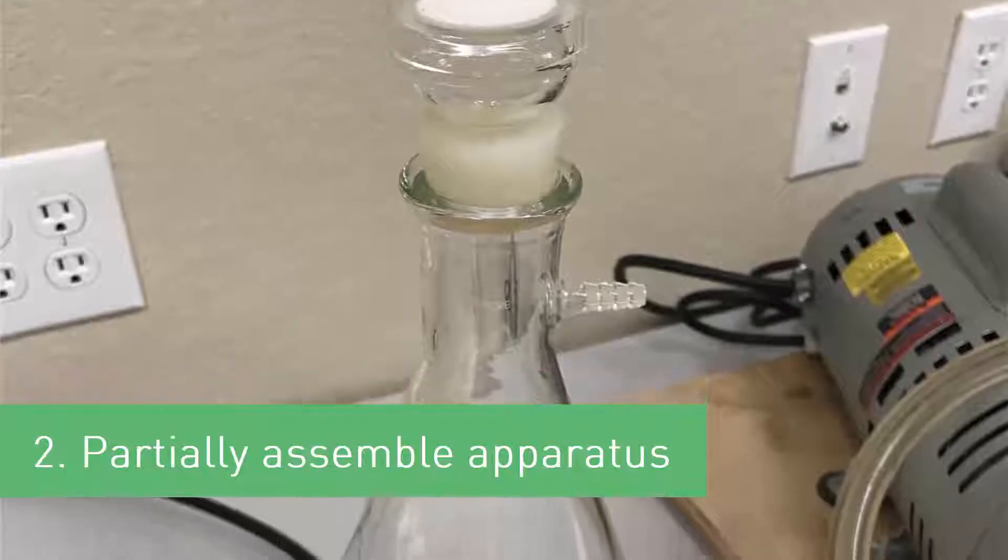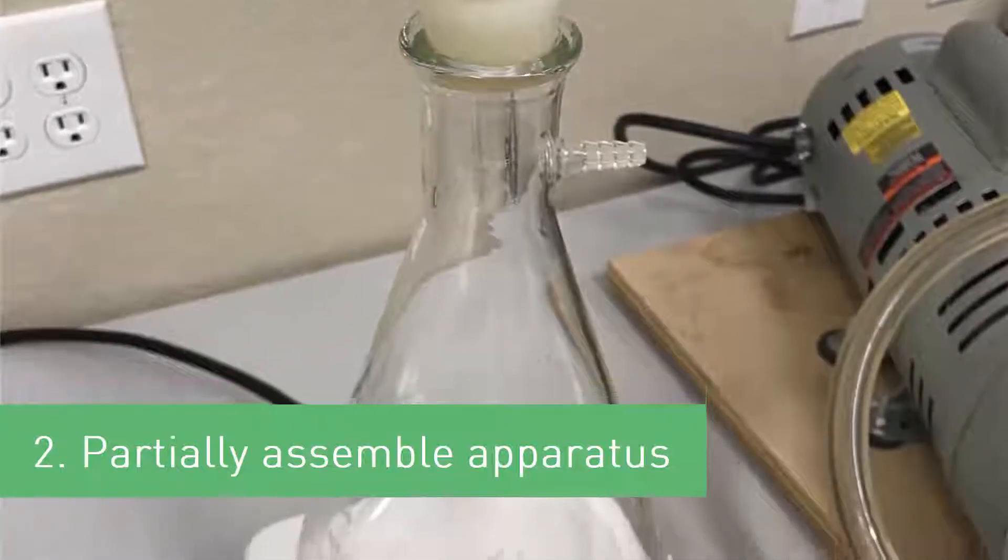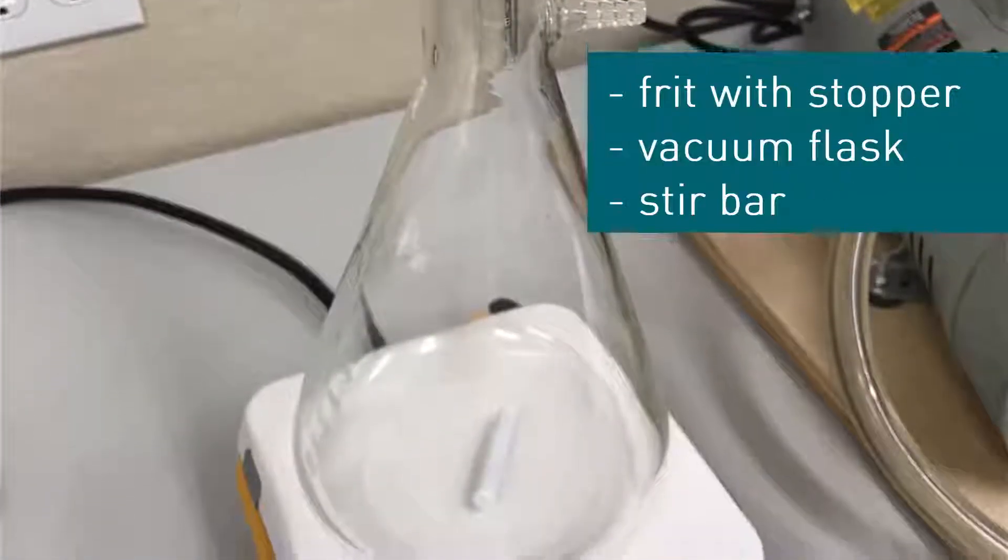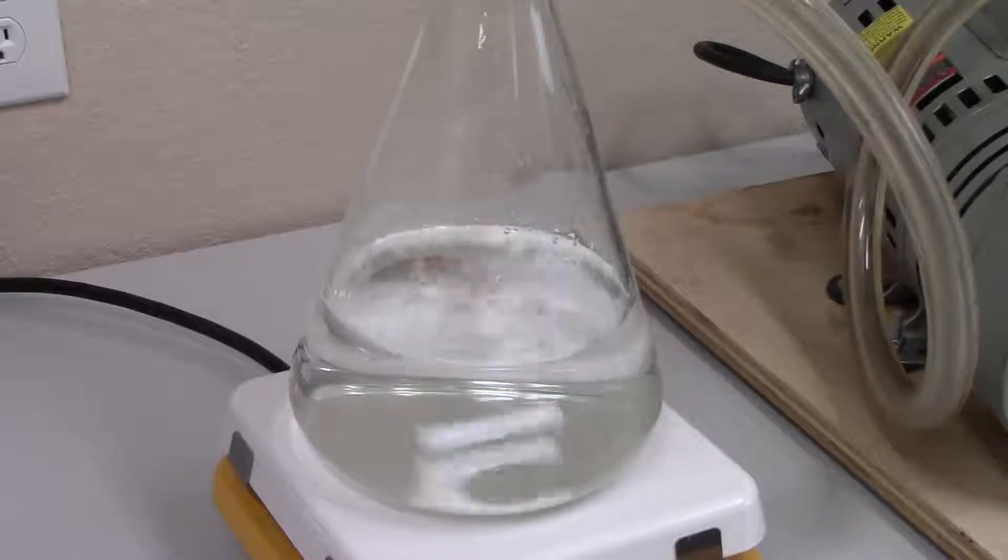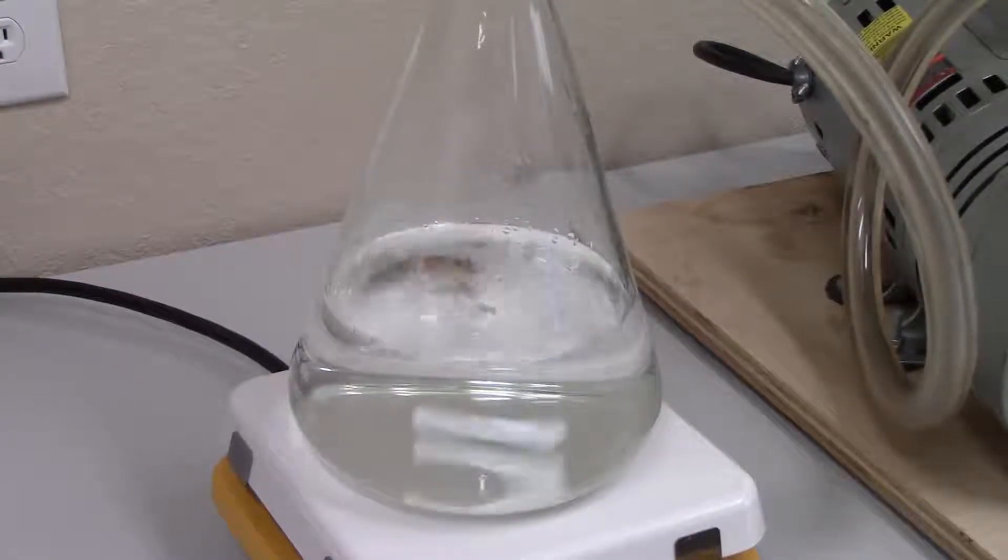While the salt is dissolving, I'll move to the second step, partially assembling the vacuum filtration apparatus. It is recommended to use a stir bar in the filter flask to agitate the filtrate while under vacuum, effectively degassing the mobile phase during the preparation process.